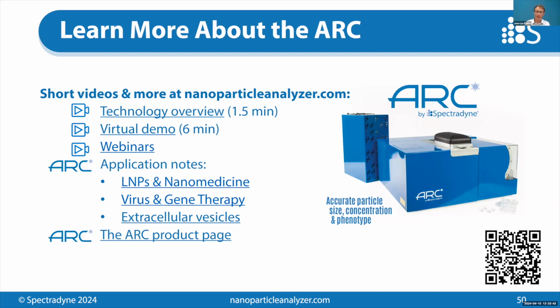Okay, so first question is from Regina. The question is, our sample is polydispersed with particles below 65 nanometers, below the cutoff of the cartridges, and how does this affect the accuracy of the measurement? So the answer is that it does not affect the accuracy of the measurement. The reason there's a limit of detection for any given cartridge size is that particles that are below that level are too small to generate an appreciable signal that can be detected, right? And so they just pass through the constriction without generating a signal, and so that doesn't affect the measurement, right?